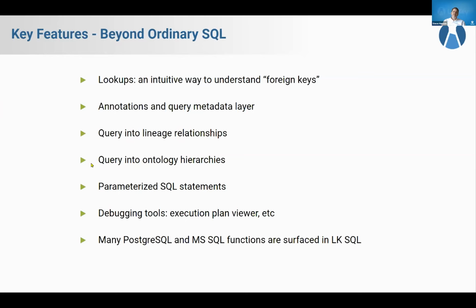And we also give you similar ability to query into ontology hierarchies. So if you have brought in the ontology module to help annotate, say, a field in one of your tables, we let the LabKey SQL queries also ask about what the ontology hierarchy is like for this particular field I'm looking at.